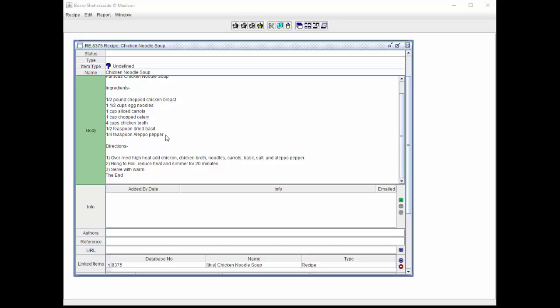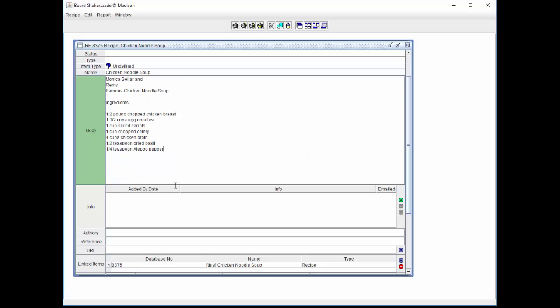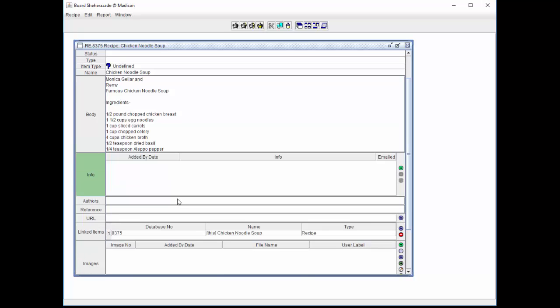If information in the field is added or removed, the field size will adjust. For example, if some of the text is deleted, after clicking into another field, it is shown the field is minimized to the size of the text.